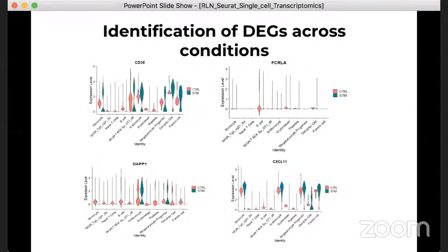So far we have been discussing single cell RNA quantification methods measured for samples of one condition. We can also have samples for which single cell data is recorded for multiple different conditions, or for multiple different time points.